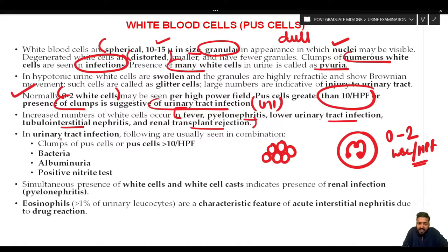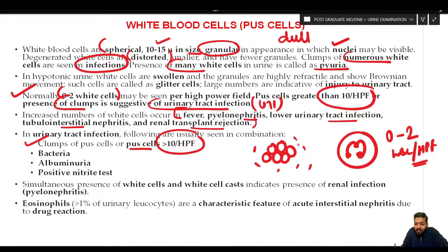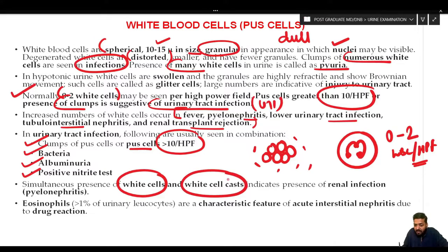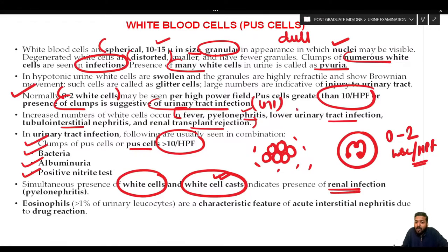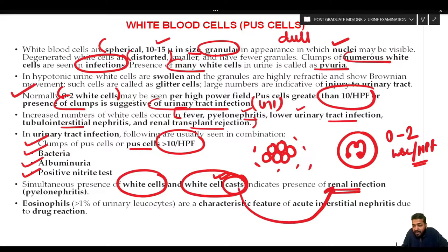In urinary tract infection, along with raised WBCs, you will get clumps of pus cells or pus cells more than 10 per high power field. In the background, bacteria (rods) may be seen, and chemically there may be albuminuria and a positive nitrite test. Simultaneous presence of white cells and white cell cast indicates renal infection — confirming the infection is originating from the kidneys.